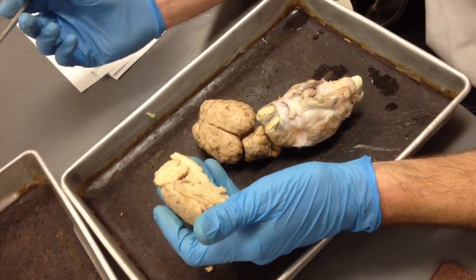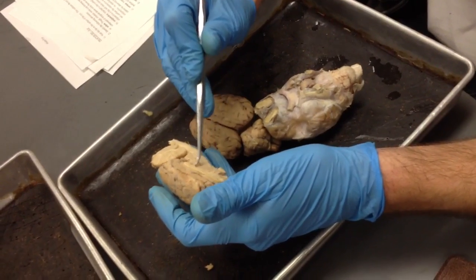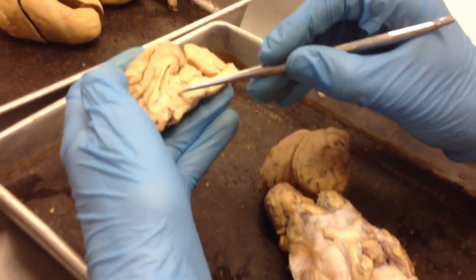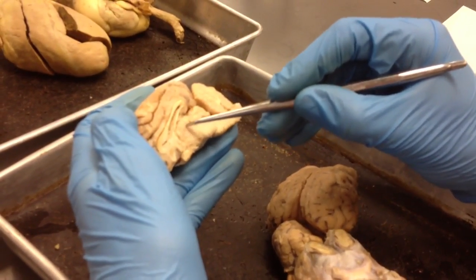The thalamus. Thalamus is this nice circle here. Okay, and the inner circle of it is going to be the massa intermedia. So thalamus, massa intermedia.